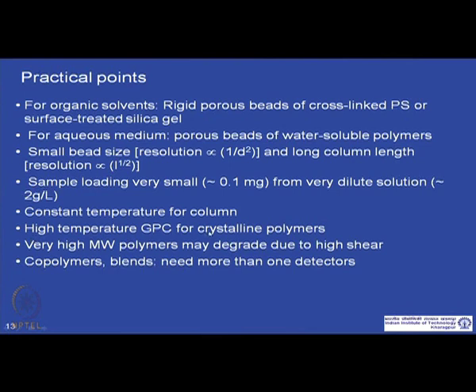High temperature GPCs are required for crystalline polymers. Crystalline polymers are not typically soluble at room temperature. So, they are dissolved at a high temperature, and the column is kept at a higher temperature, and the separation is performed at that higher temperature. So, we typically use the term high temperature GPC for that.